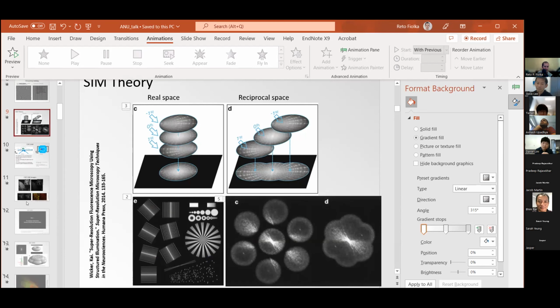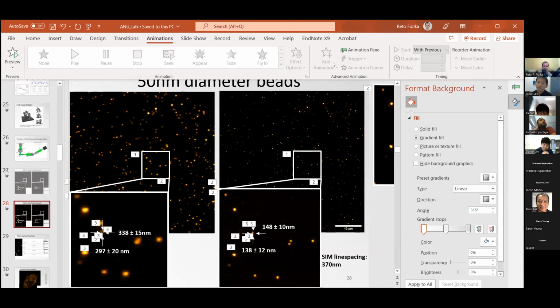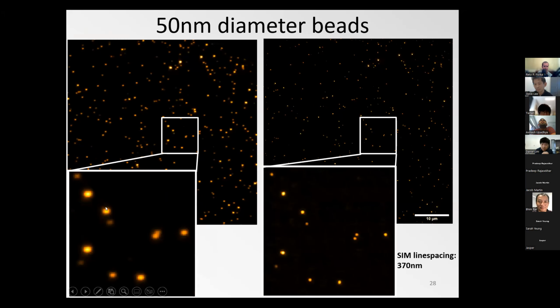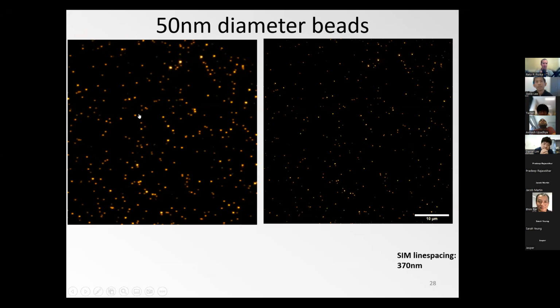There is an additional effect that is different to a normal SIM microscope, and I have not mentioned that, but it can be seen here that the normal OPM actually has some anisotropy. You can see these beads. Sure, these are maybe clustered brighter ones, but they look a little elliptical. The reason that in this direction it's a bit longer is because it loses some light. Essentially, the worst direction in the OPM PSF is in the direction you tilt. So there is a certain anisotropy. So even if you wouldn't do SIM, you can benefit in the OPM microscope from fusing 2 or 3 views.